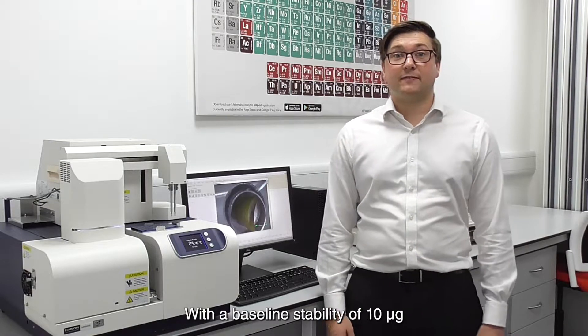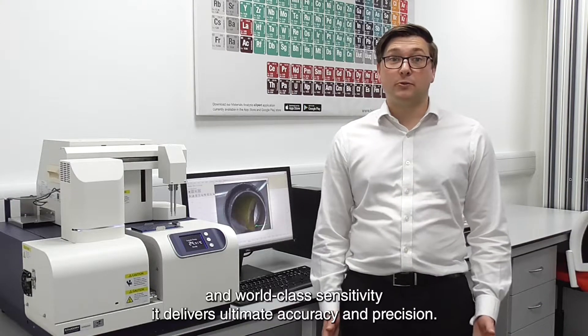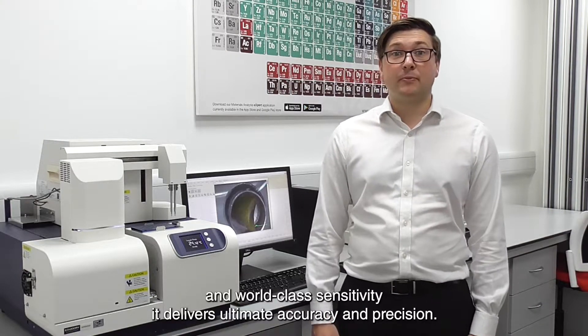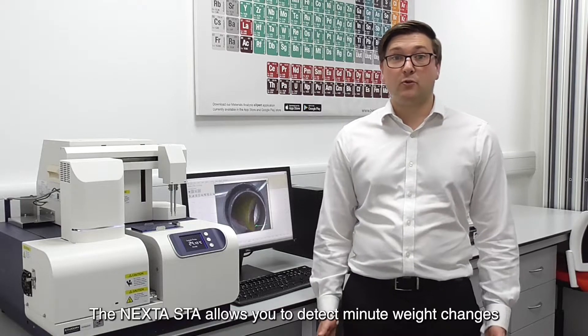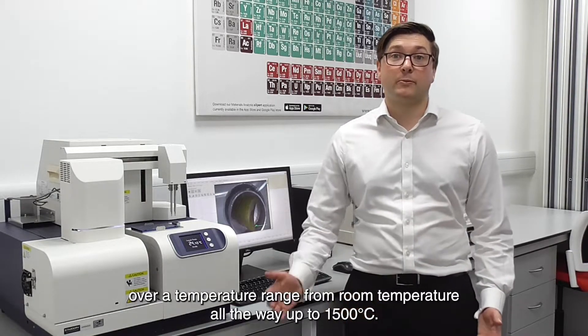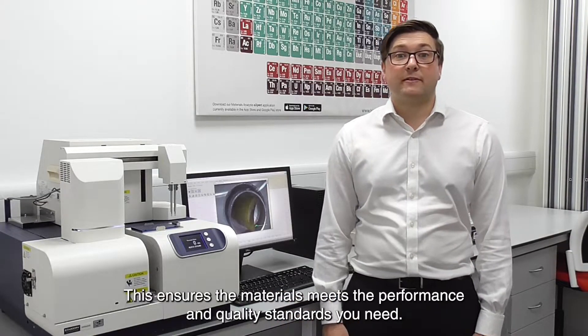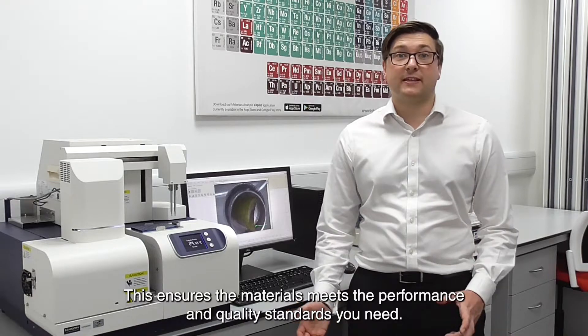With a baseline stability of 10 micrograms and world-class sensitivity, it delivers ultimate accuracy and precision. The Nexter STA allows you to detect minute weight changes over a temperature range from room temperature all the way up to 1500 degrees C, ensuring materials meet the performance and quality standards you need.